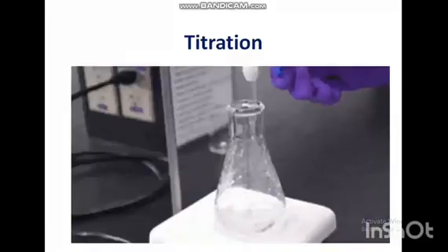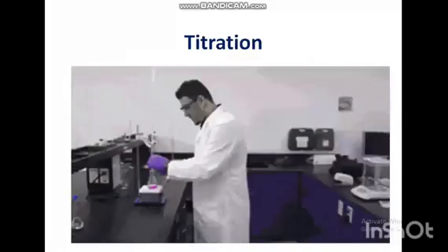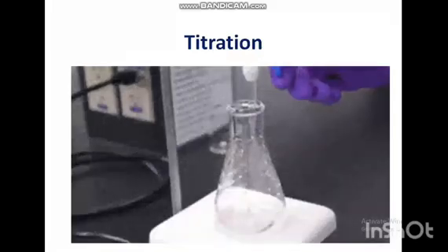The end of reaction is indicated by color change, and it is referred to as end point. This titration is also known as volumetric analysis.